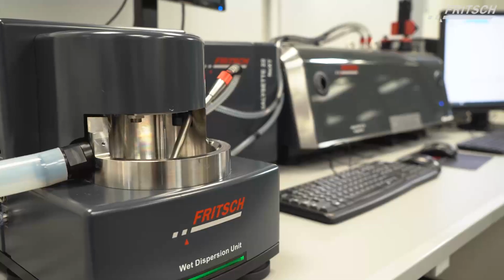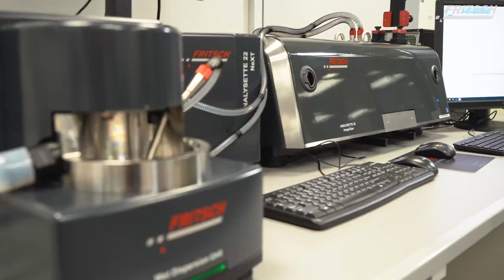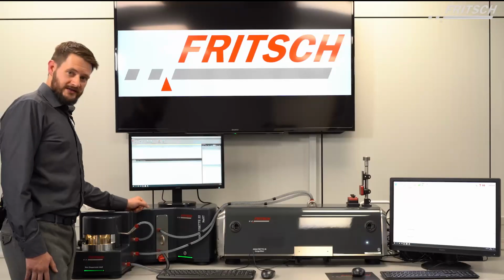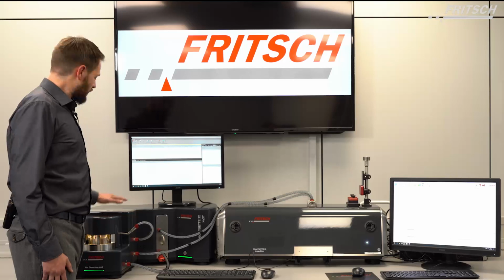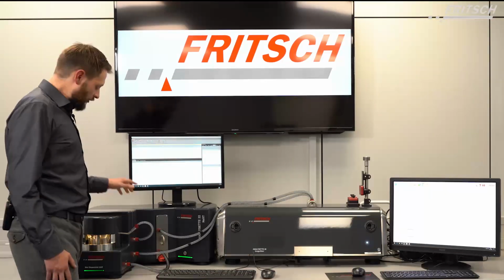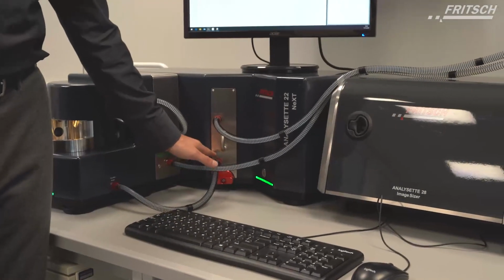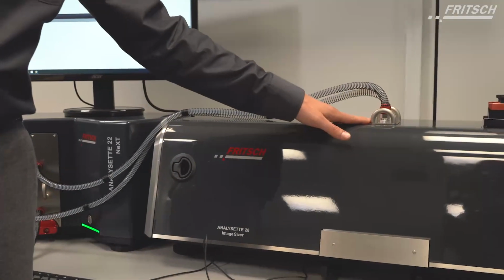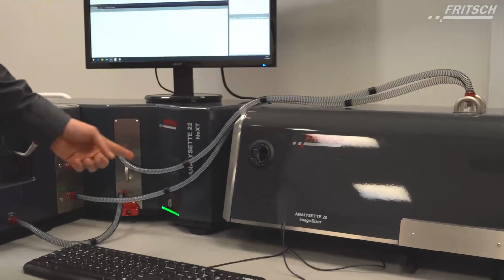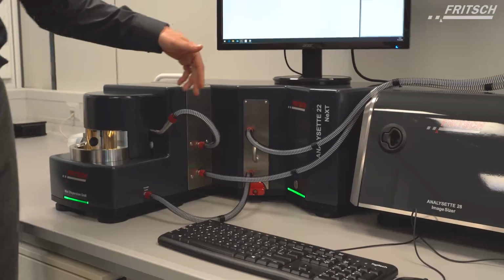Theoretically, you can connect the wet dispersing unit either with the A22 or with the A28. It is also possible to run either instrument individually. In order to measure one sample at the same time with both instruments, we control our wet dispersing unit through the software of the A22. Our sample will then be pumped into the measuring cell of the A22, come out, take a detour through the measuring cell of the A28, go back into our ultrasonic box, which at this point is optional, and then get back into the dispersing unit.